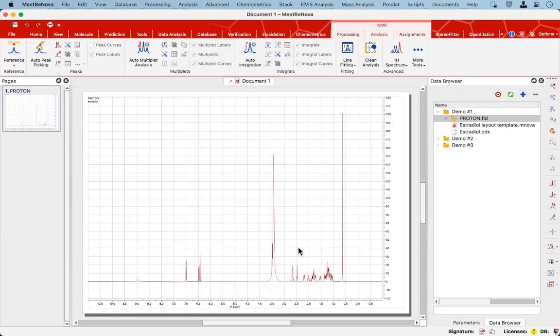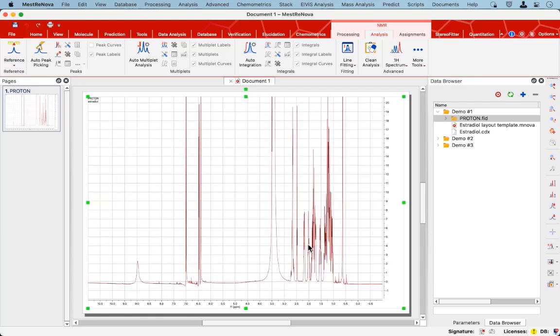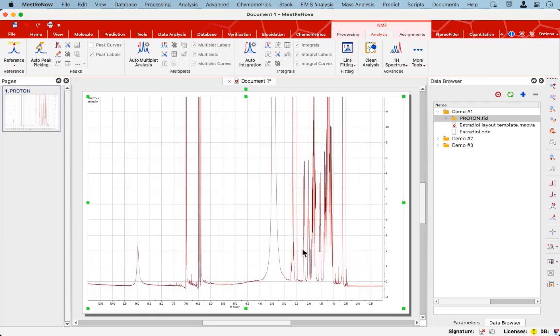If I increase the intensity slightly, one can see that this spectrum needs some phasing and it needs some baseline correction.